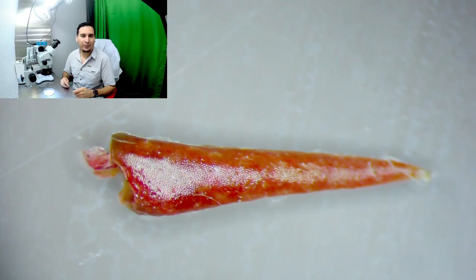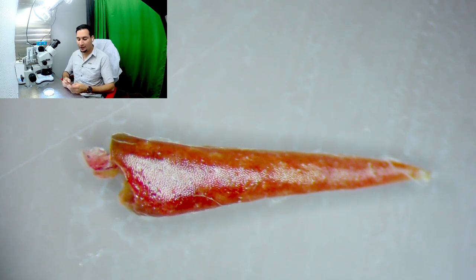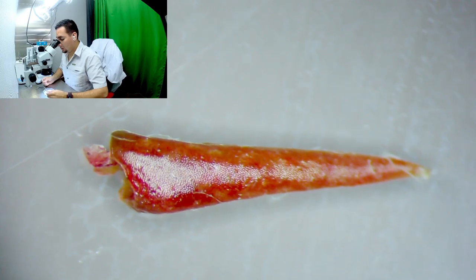This is the begonia apical meristem culture — the first plant we started working on in class. I want to start my culture using fine point forceps and a fine point scalpel. Let's get started. I can see it's well in focus and I'm at a good distance to begin.